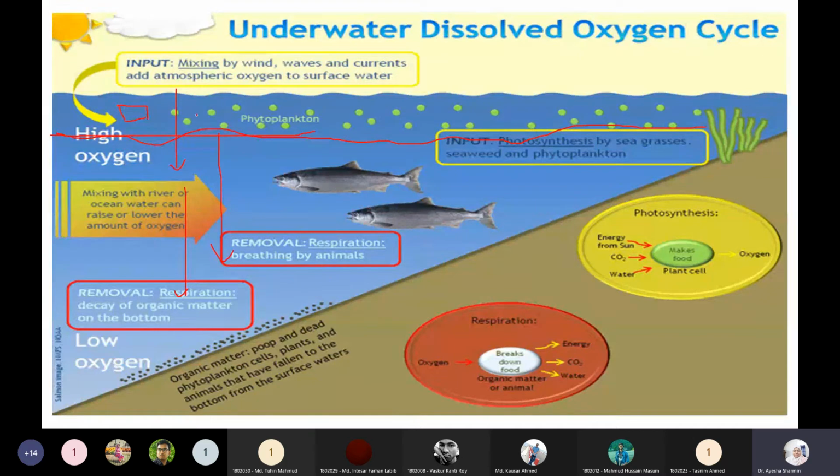That means take some water out, and then dip it nicely, without getting any air inside. They take only the water up to the mark and then close the lid immediately so that it doesn't get any air from the outside of this water surface. That's very, very crucial, so that you don't introduce excess air from other sources. You're just taking the sample only from the water.